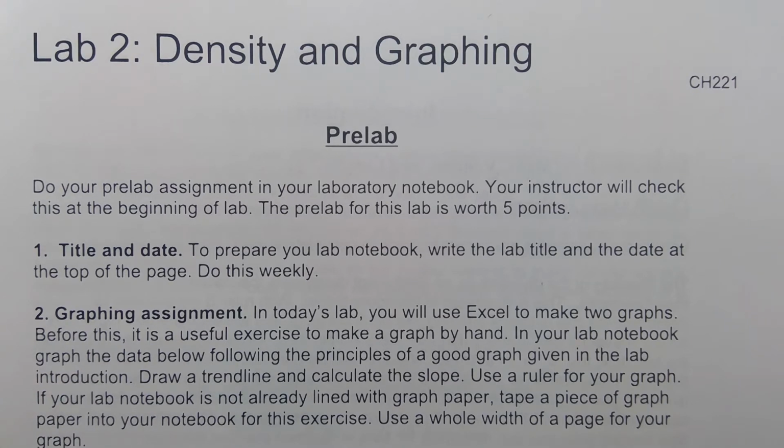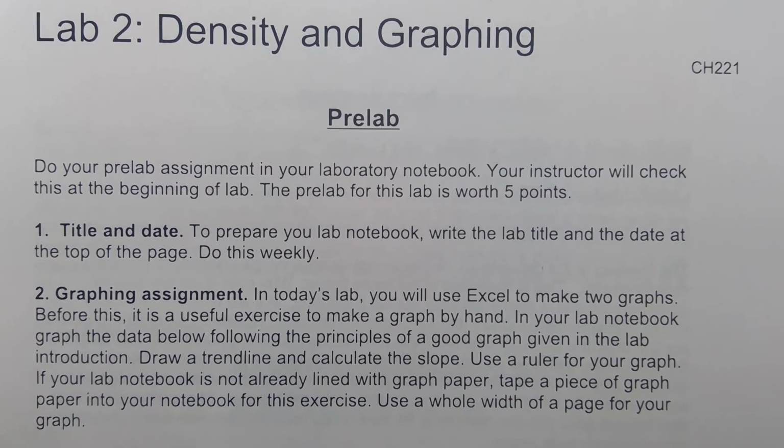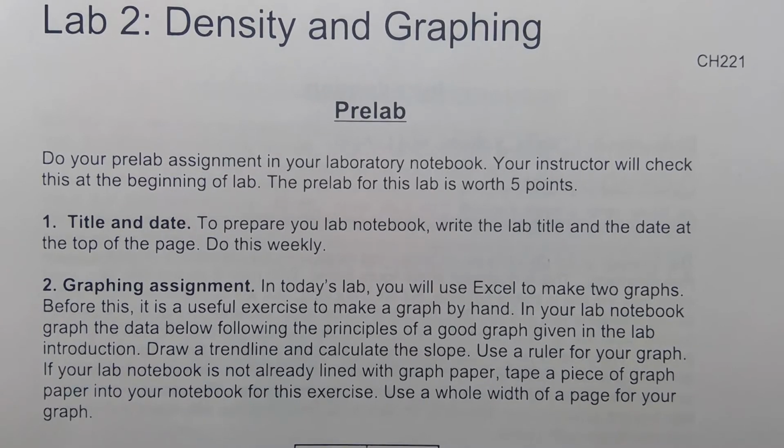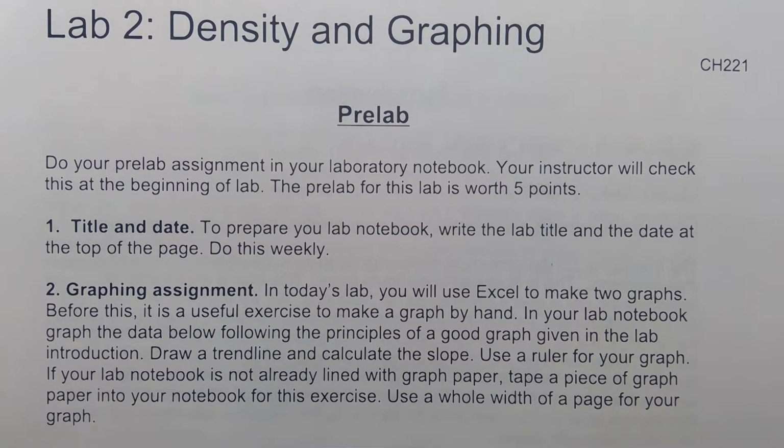Hello, this video is for Chemistry 221, Lab 2, Density and Graphing, but you may also be watching this for Chemistry 151, Lab 5, which is the same lab. You'll want to do the pre-lab before we begin, but there's a lot that they want me to explain about Excel and graphing, so I'll go through this with you.